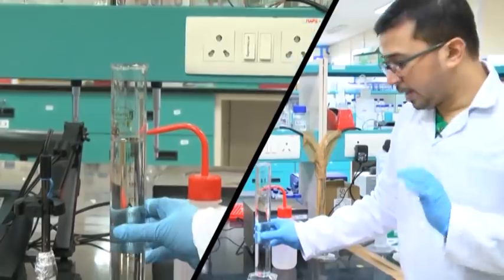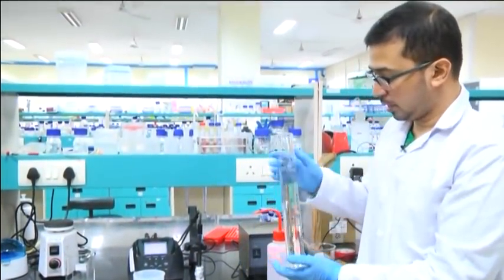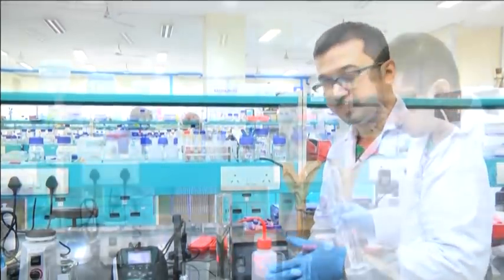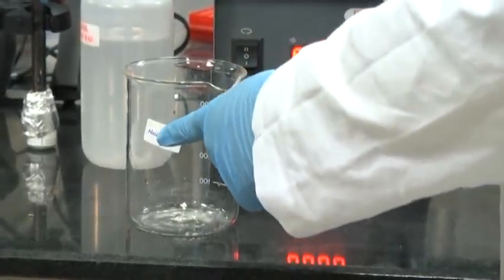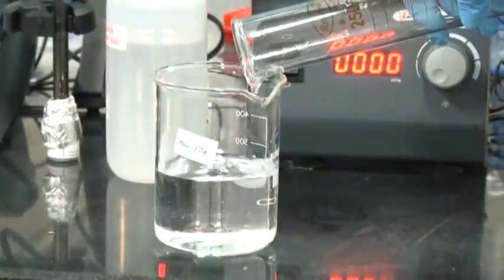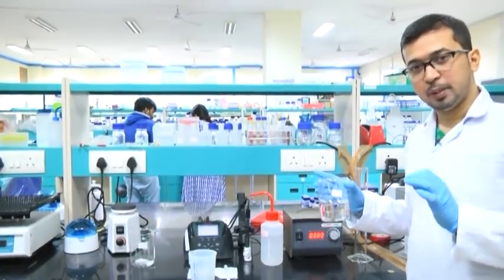Bring it to your eye level, take it out, check, and it is more or less okay. Here we have measured 250 ml of sodium hydrogen phosphate monobasic and we will transfer this again into a beaker marked as NaH₂PO₄ — that is the monobasic one. We have now prepared 250 ml, 100 millimolar of sodium hydrogen phosphate monobasic.